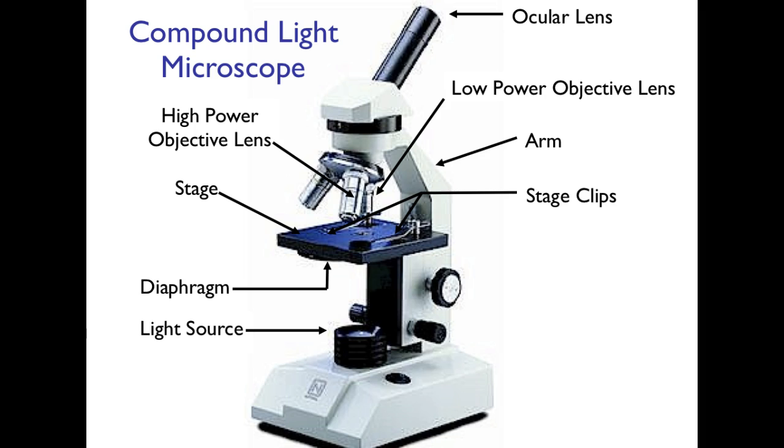You of course have to have a light source. On most modern compound light microscopes, this is provided by some kind of lamp. There are some that still exist that have a mirror that redirects light from outside the microscope through the specimen.